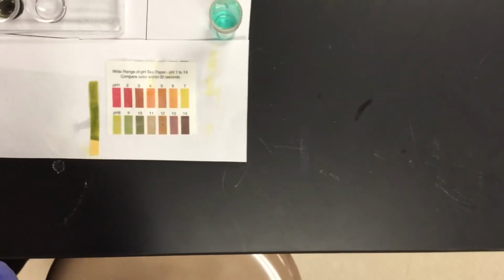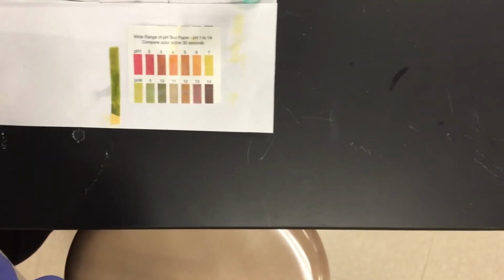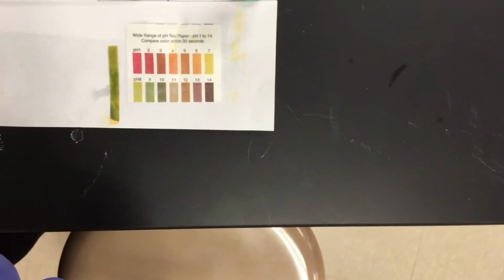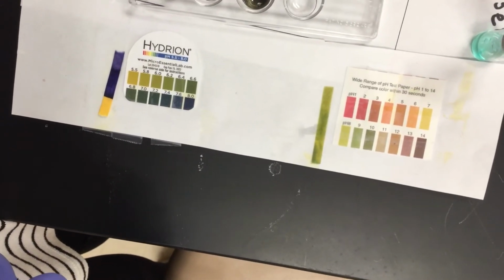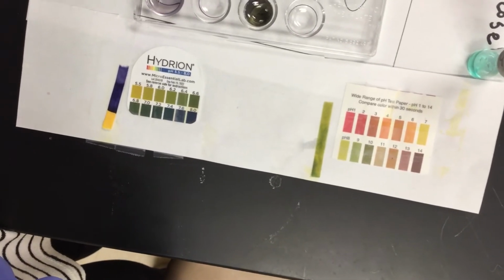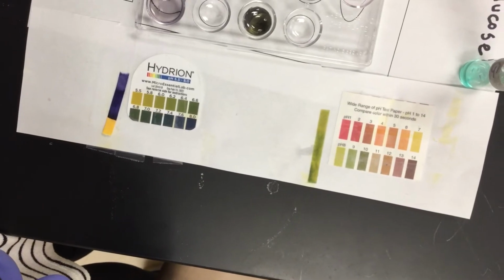There's my first type. You want to put that number into your data chart. There are the results. Match it up. If you want to go a half number, you can. Next to that, put a little dash and put your second pH. Hopefully these two numbers are close. So this scale goes a little bit more exact. I'm just giving you a chance to work with a couple of different types of pH paper to see that we can measure the amount of hydrogen ions in a couple different fashions.